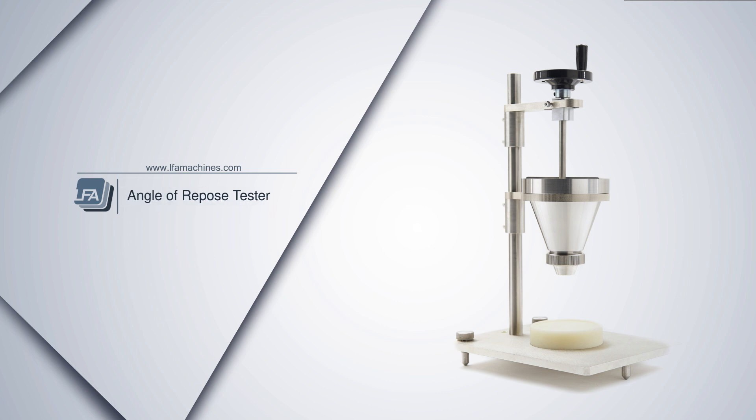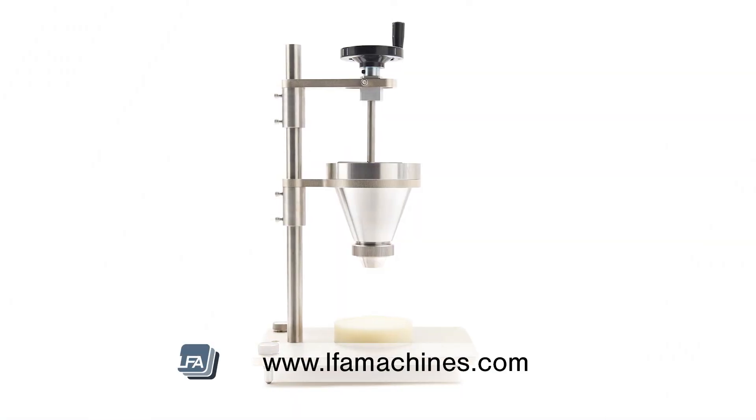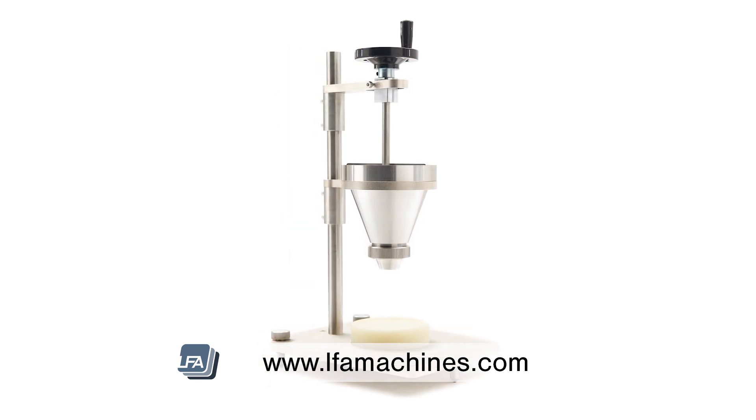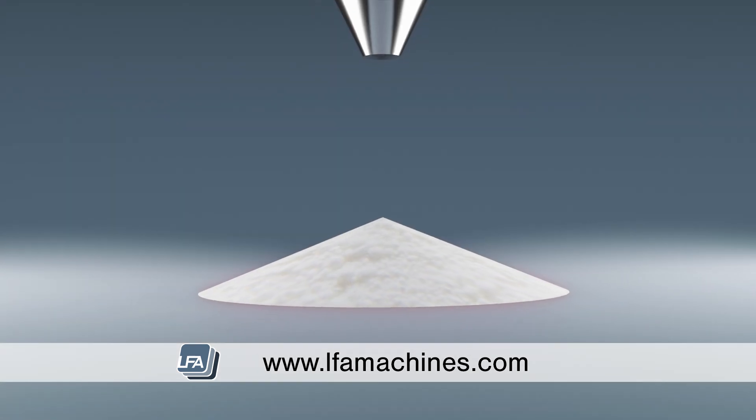The LFA ART1 has been designed to measure the behaviour and flow of formulations, granules and powders. This is a test that conforms to USP 1174 standards, making it suitable for measuring your angle of repose.